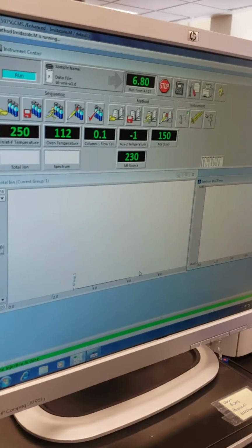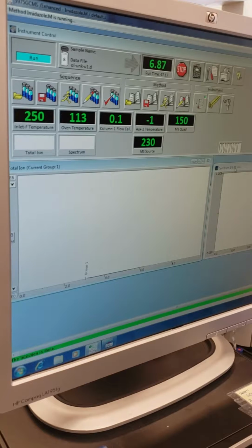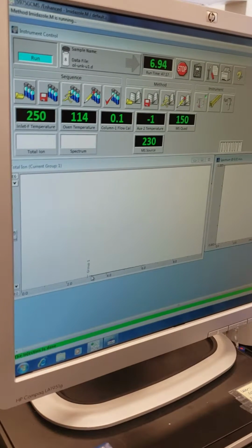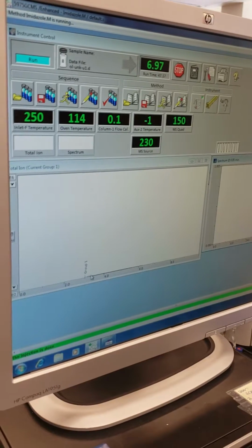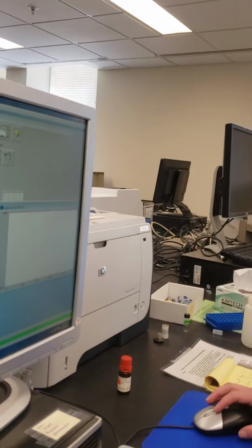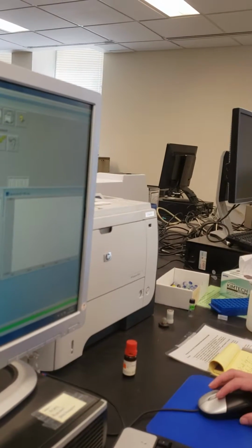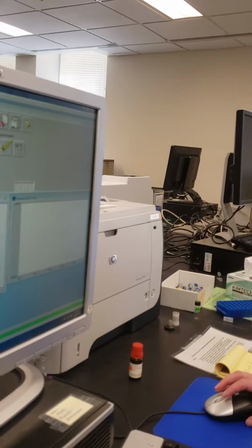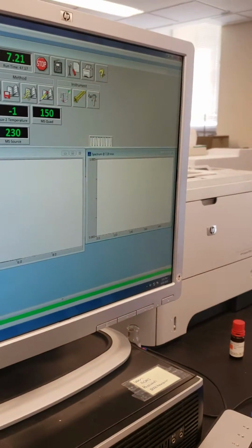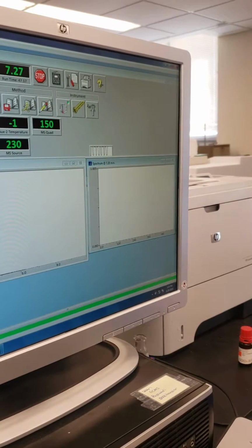We have dichloromethane as solvent, and I could be expecting to see it very quickly, but I don't know. Well, it didn't start until 3 minutes after it injected, because of the solvent delay. So you probably won't see the solvent. Only if I have very volatile solvents is it better to choose not to have the delay. You can change that delay to a minute or half a minute or whatever you want.